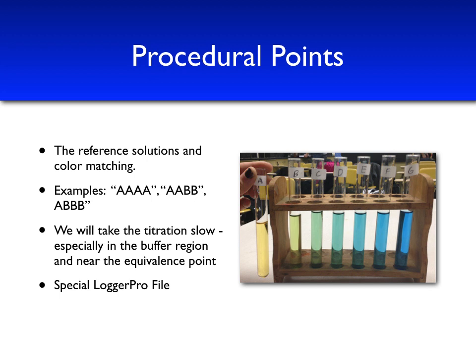We will use a 4-letter designation to determine the color. For example, at the start of our titration, where there's just acetic acid, our titration solution will look a lot like reference solution A. We might call this AAAA, 4 A's to represent that the solution looks just like reference solution A. We can also get to a point where the titration solution looks somewhere right in between reference solution A and reference solution B. We can therefore call it AABB.